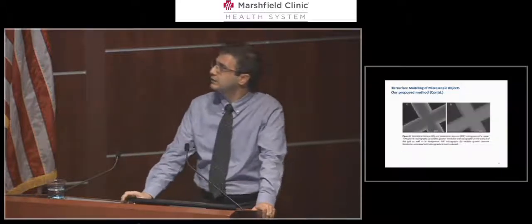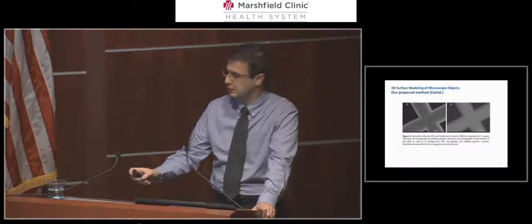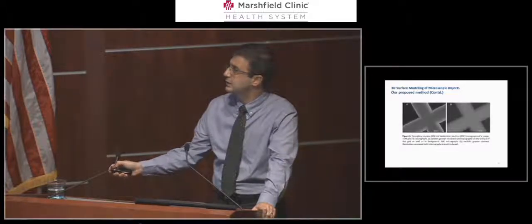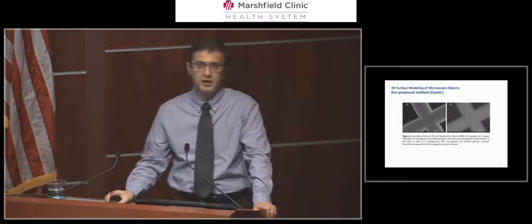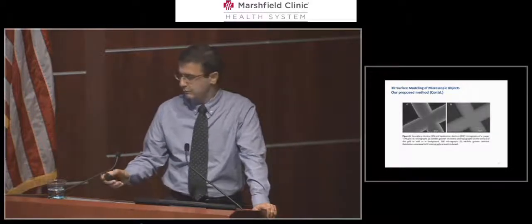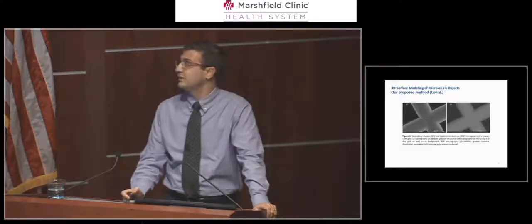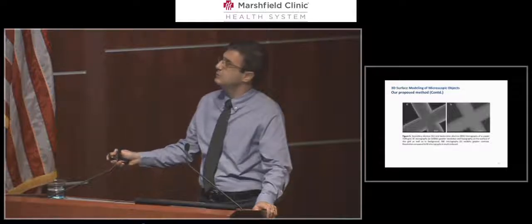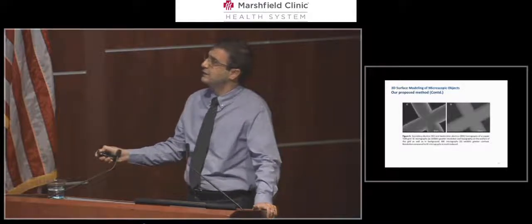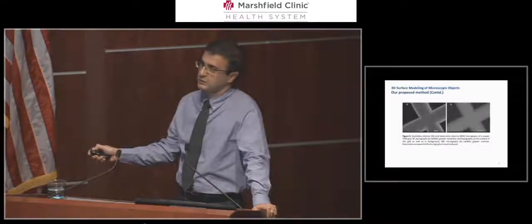Electron beam emitted from the electron gun can induce different signals, including secondary electron and backscatter electron, yielding different types of digital images. While the SE detector can generate higher resolution and darker intensities, the BSE, I mean backscatter electron detector, can produce lower resolution with brighter intensity.